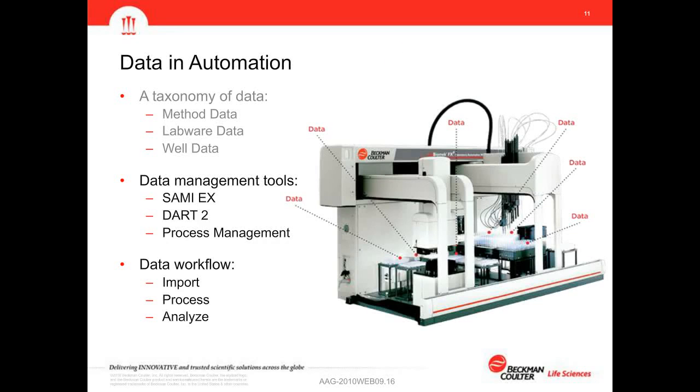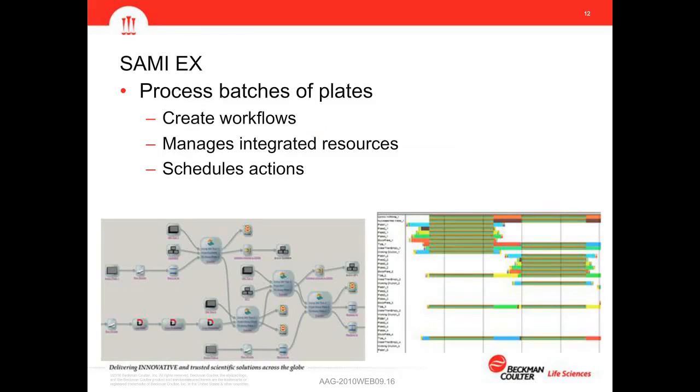So now we've covered the first third of our presentation, looking at the different hierarchy of data with method, labware, and well data. If you do have any questions, take a moment to go ahead and enter that question, and we'll move on to talk about 3 data management tools.